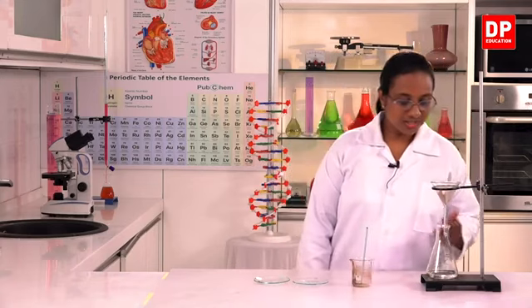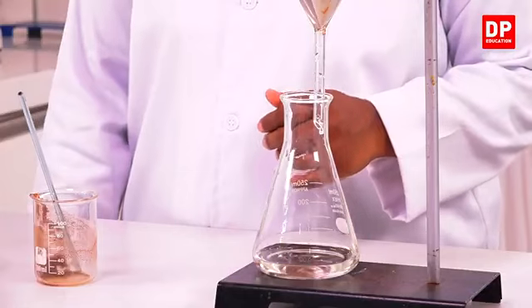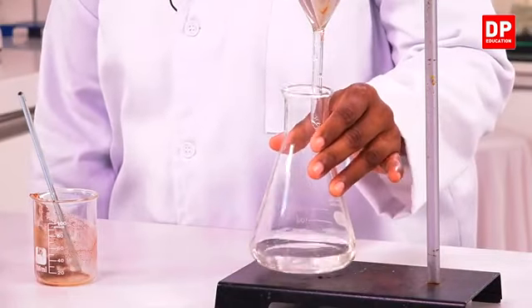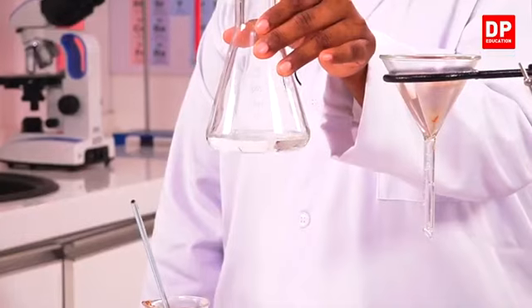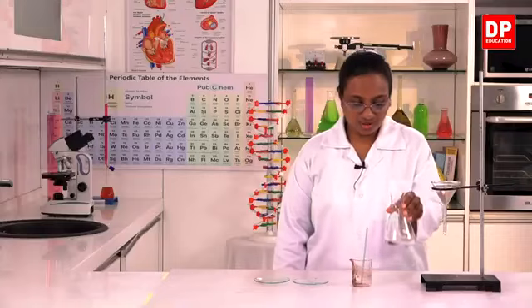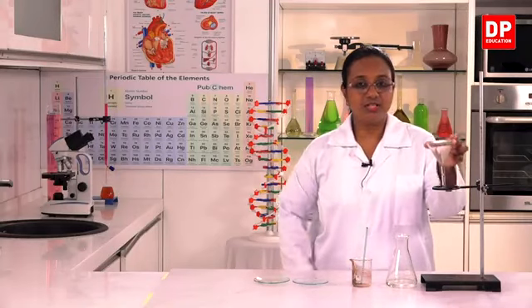Okay students, now almost the solution has got filtered into the conical flask. So here you can see it is a clear solution that has been obtained inside the conical flask. So that is the sodium chloride solution. And here I have the residue.